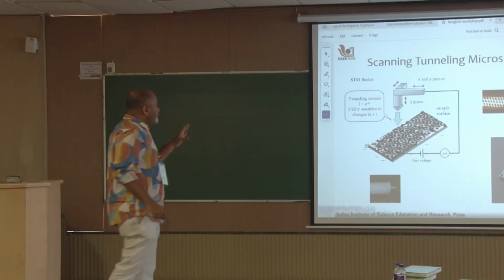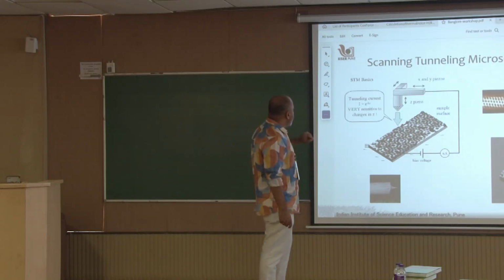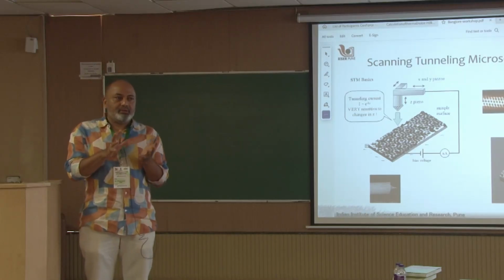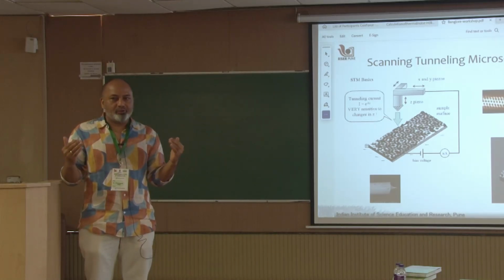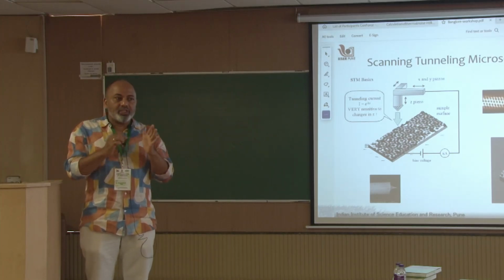And so here you mount it on a tripod design and you bring it all the way down to 2 angstroms, and the moment you come that close, the electrons from the tip and from the sample don't know whether they belong to the tip or to the sample, right? The wavelength spans over a couple of angstroms, over a nanometer, and this is once again a phenomenon called tunneling. So apply a small bias between tip and sample, about 100 millivolts or so, even 10 millivolts is good, and then without touching, current starts to flow.